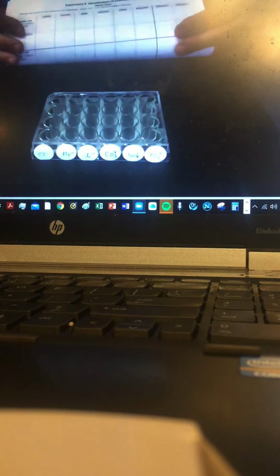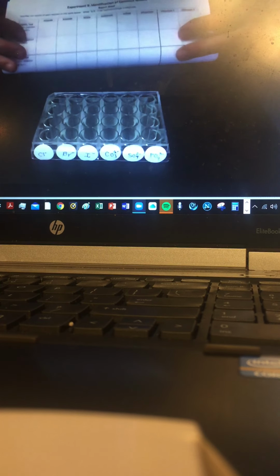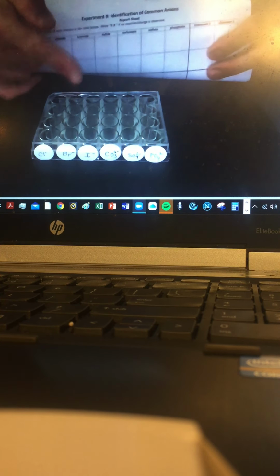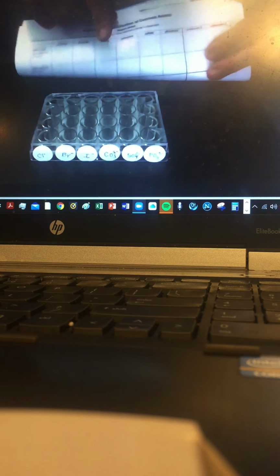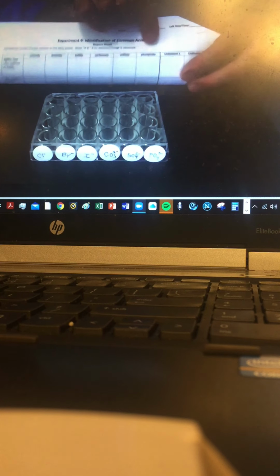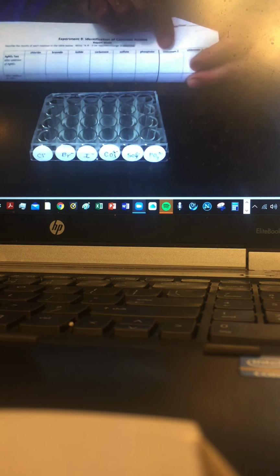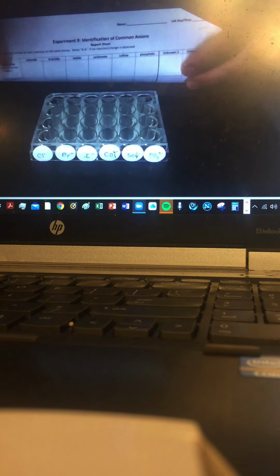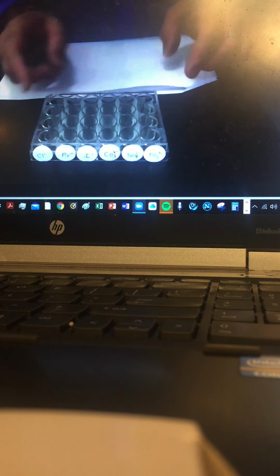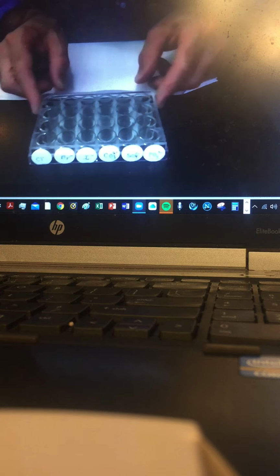I'll be checking for the existence of the chloride, bromide, iodide, and for the polyatomic ions, so the replica has carbonate, sulfate, phosphate. Now my two unknowns, based on that matrix, are located on these two sides.